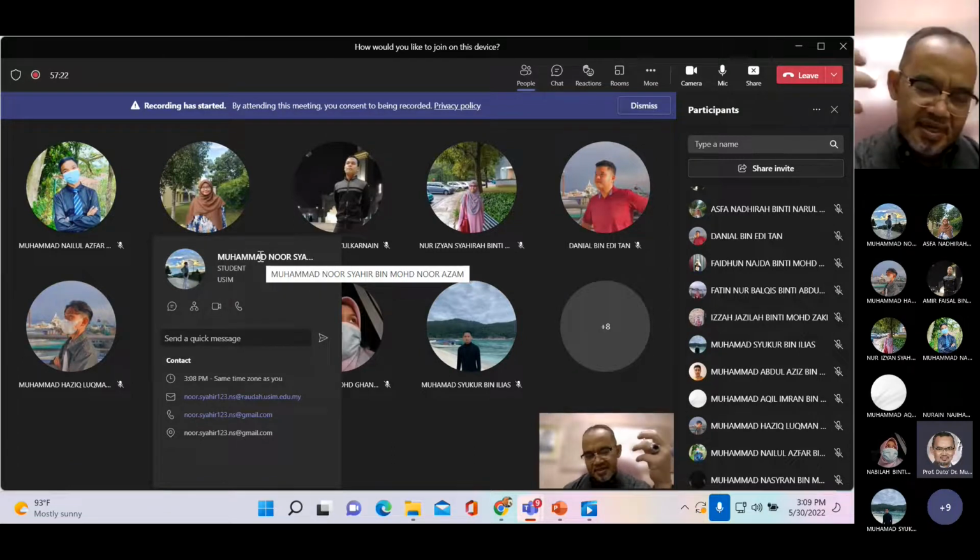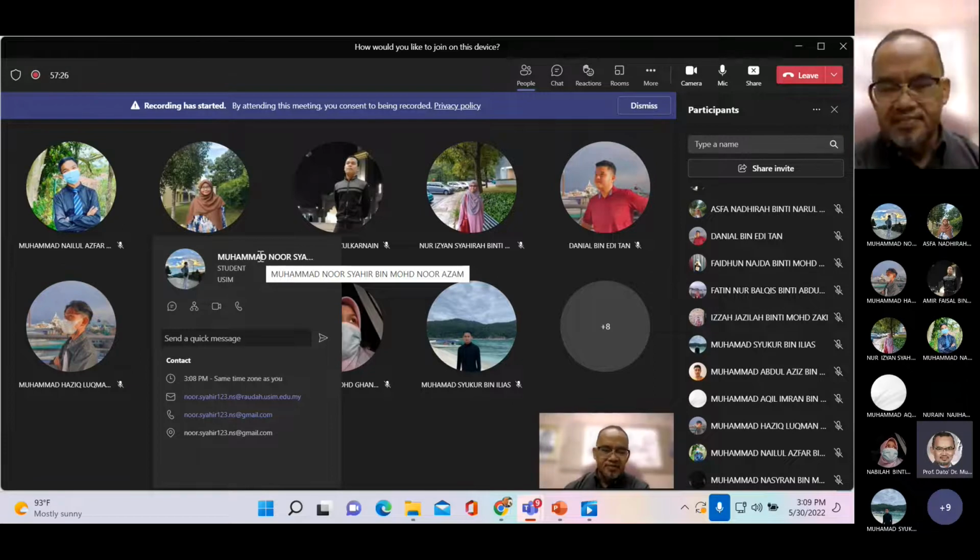But the rest will be transmitted to the detector. So we're having the light. A part of it will be absorbed, and some of it will be transmitted to the detector.